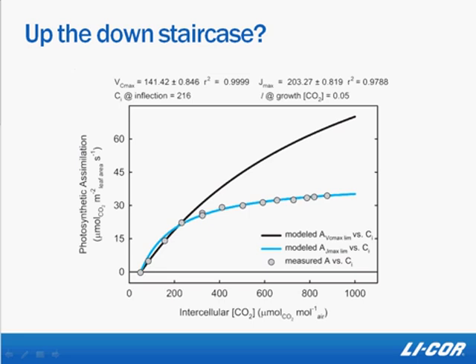If you're interested in the CO2 compensation point, you'll probably focus on the lower end of the curve. If you want to know about Jmax or TPU, you'd focus on the upper end of the curve. How you set your concentrations will be affected by these choices. Either way, determine what question you want to answer and start from there, rather than assuming that just because one paper or one researcher did it this way, or even that you see it in our manual done this way, you should do it that way. It will all depend on the question you're answering.